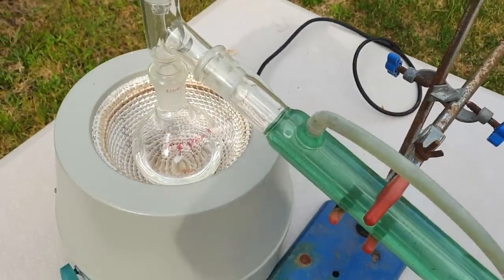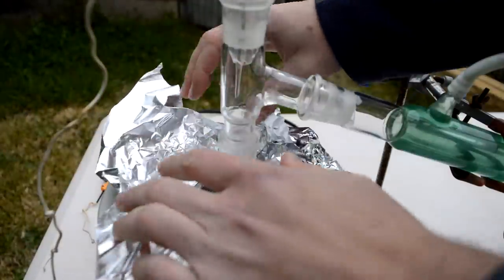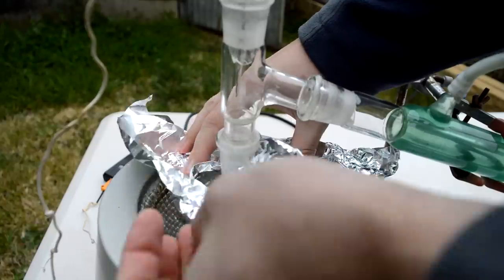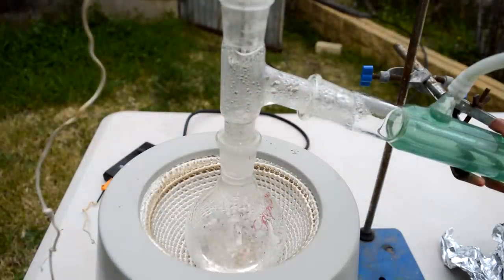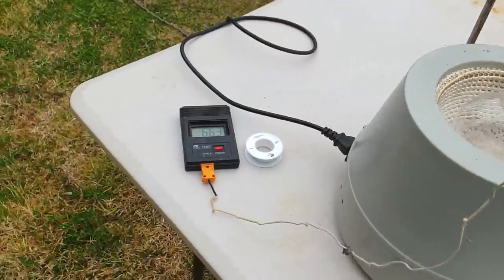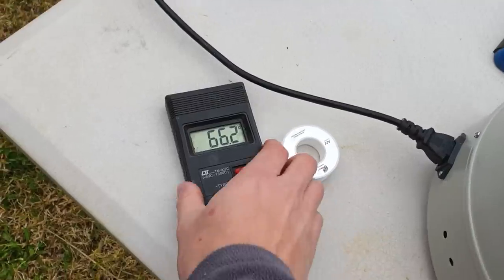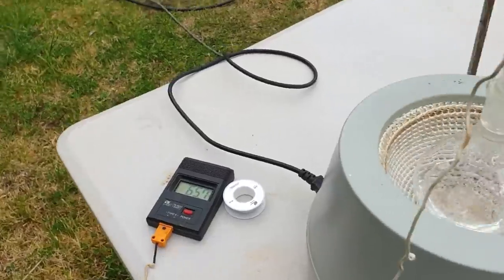So we'll slowly heat the water and see what temperature it boils over. I need the thermometer in there, but yeah. I've got a tiny piddly little stir bar in there, which isn't helping. It's bumping quite significantly, but it appears to be working fine. And a key bit of information here is that our temperature is 66 degrees. So now using that, we can calculate what our pressure is here in this system.